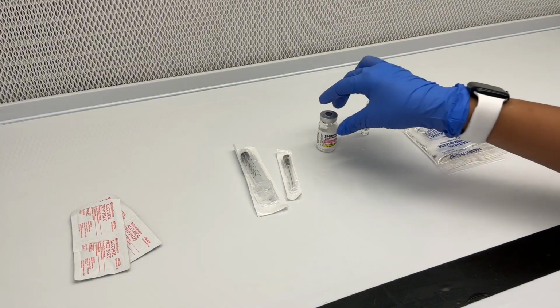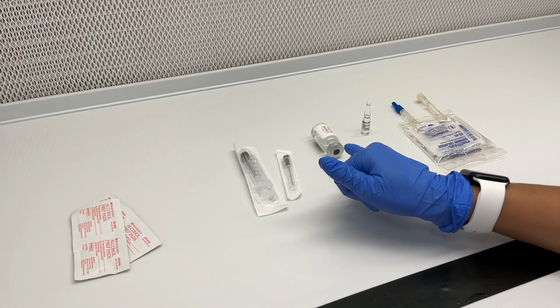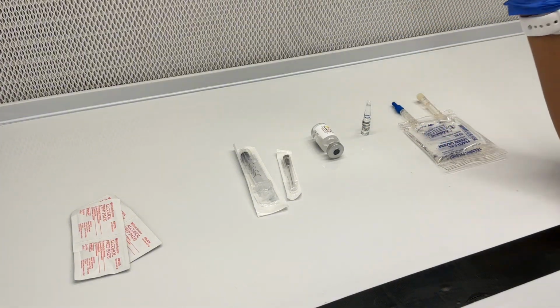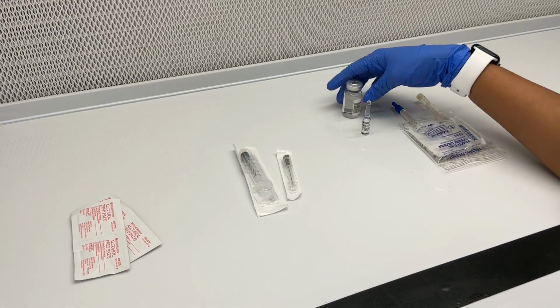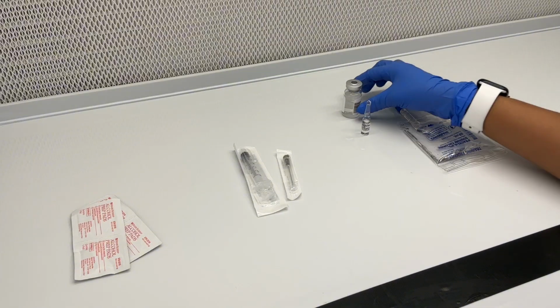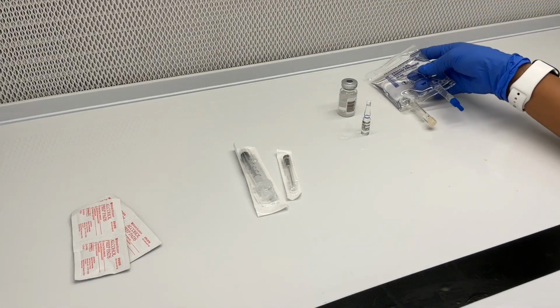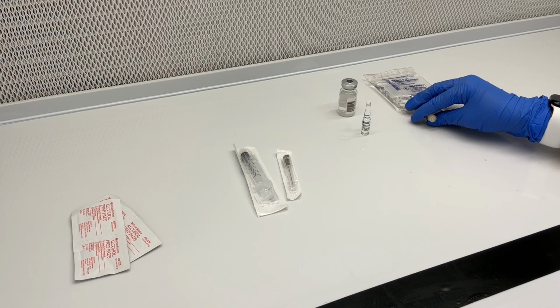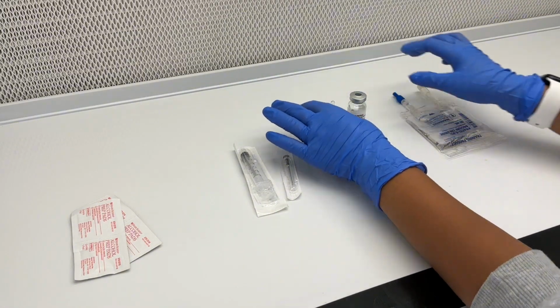What wouldn't be first air would be this. So this is your injection site, this is your critical site. Your critical site is not facing the airflow, therefore the airflow cannot push anything off of your critical site. This is first air for the vial, but not for the ampule. So your vial is getting first air, but not your ampule. This would be incorrect as well, as your injection port is facing away from the HEPA filter. So this is the proper arrangement of it all.